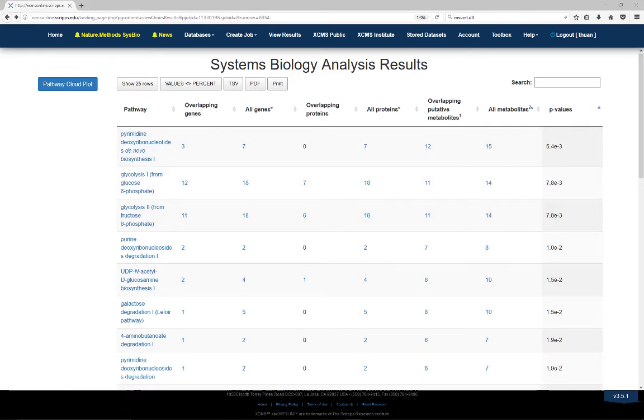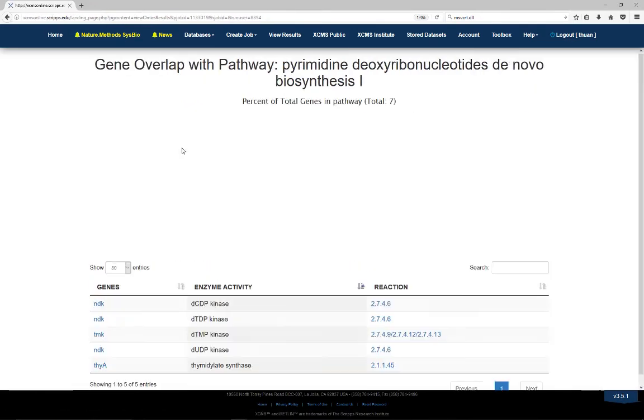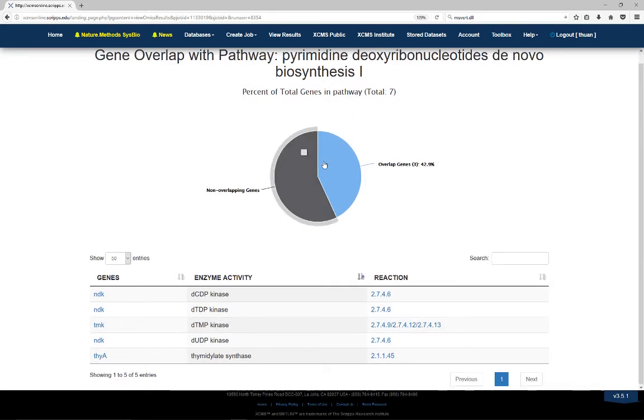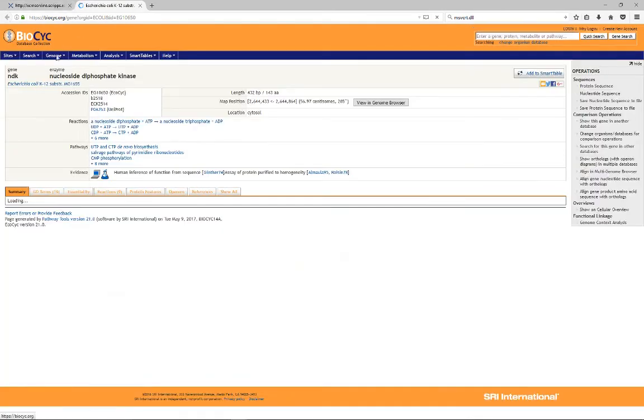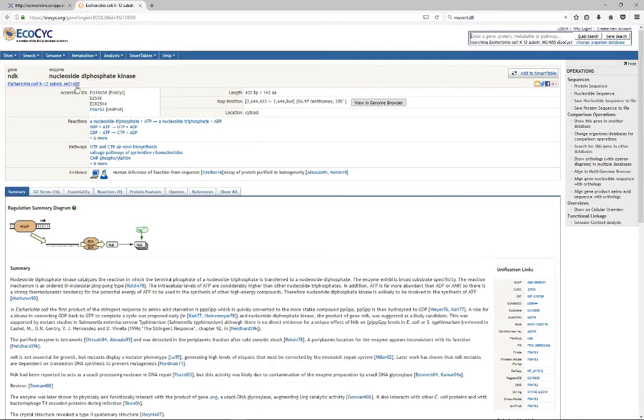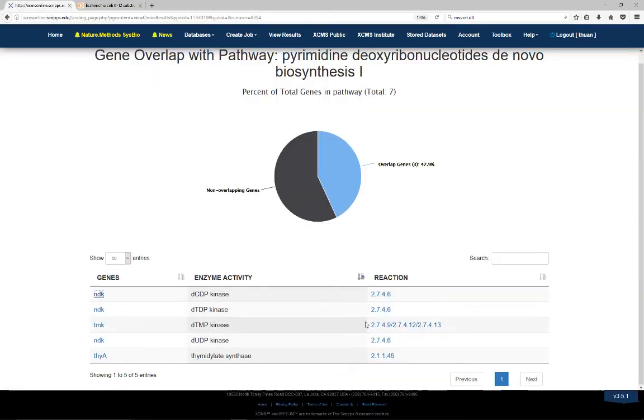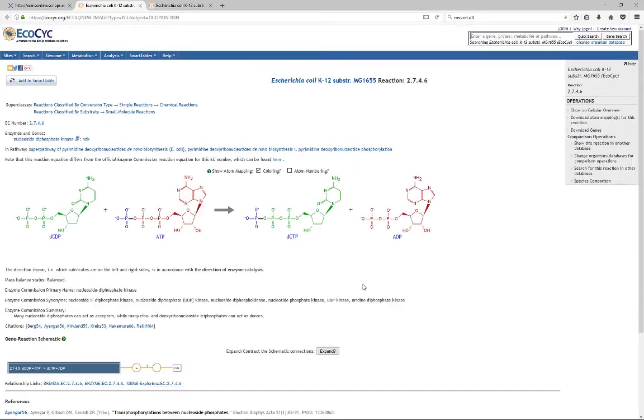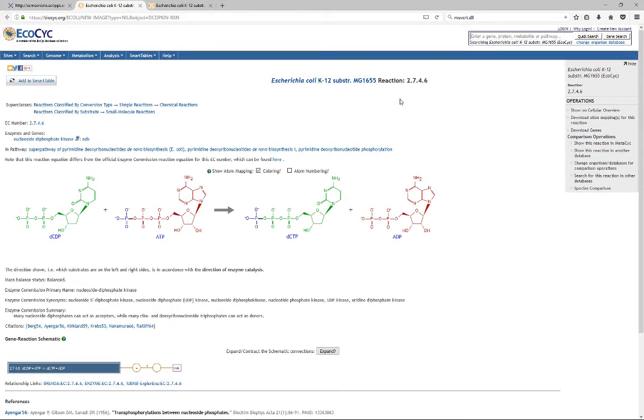Clicking on the overlapping gene number in a pathway will open a new window showing the percentage of overlapping genes within that pathway and a detailed list of the overlapped genes. Clicking on the gene name will link to the Biocyc page containing the gene information. Clicking on the enzyme commission number will open a page describing the enzymatic reaction for the encoded protein related to that gene.